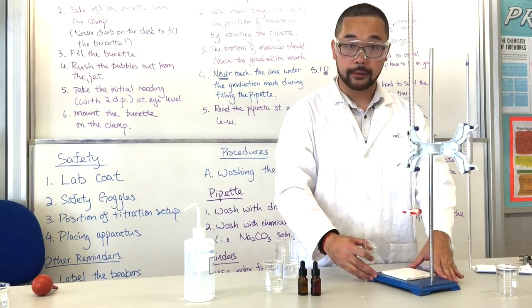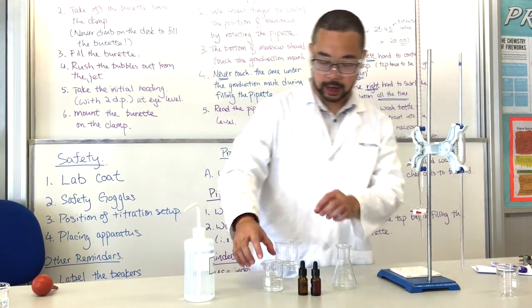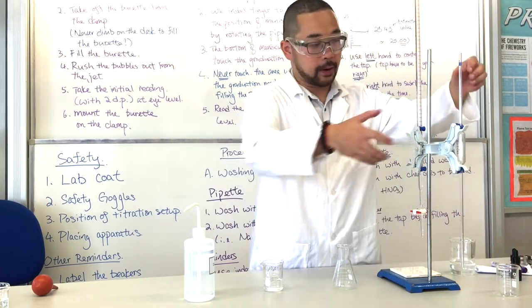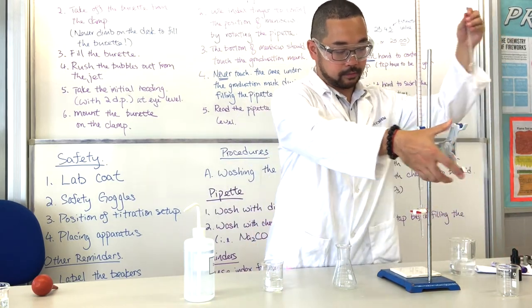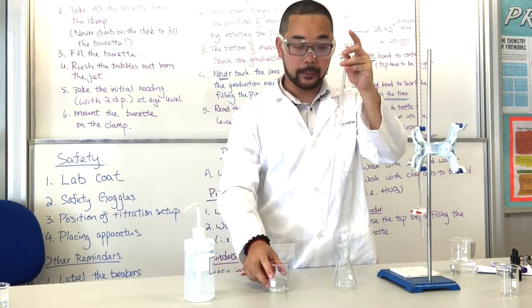After filling the burette, next we're going to fill the conical flask. For the conical flask, we're going to use sodium carbonate. So, take out the burette from the clamp, pipette.